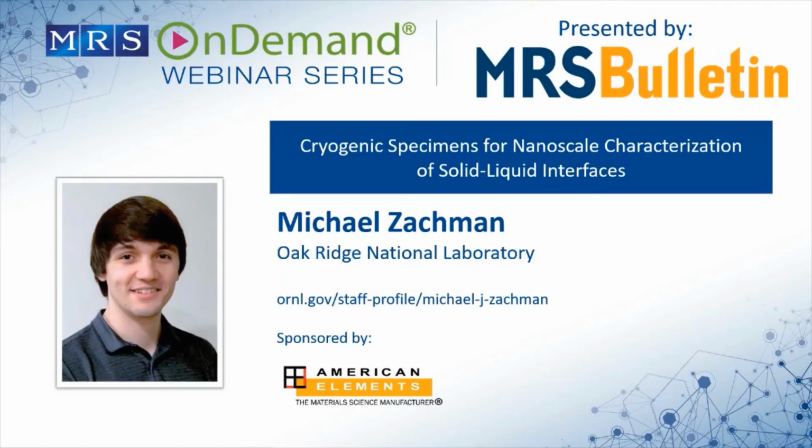If you're doing that type of thing, you can freeze your sample directly onto the grid. And then all you need is somewhere to keep that sample underneath liquid nitrogen, and you can use a standard cryo holder, for example, from Gatan. They're very similar to a normal side entry holder, but they have a big liquid nitrogen dewar on the side. And then on the tip, they have a little device that slides over the area where you put the sample that's supposed to help with that contamination issue that I was talking about when you transfer.